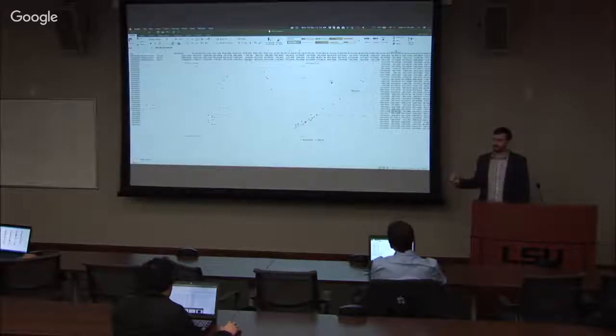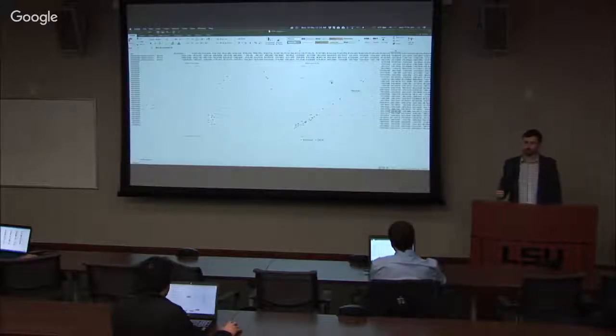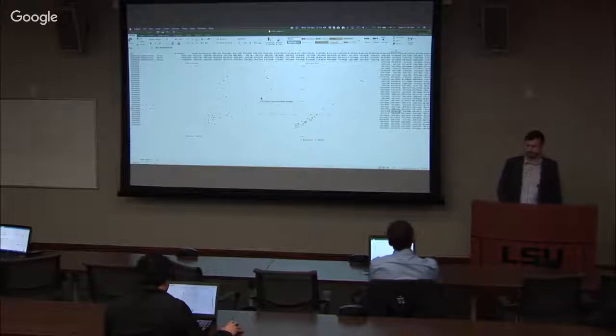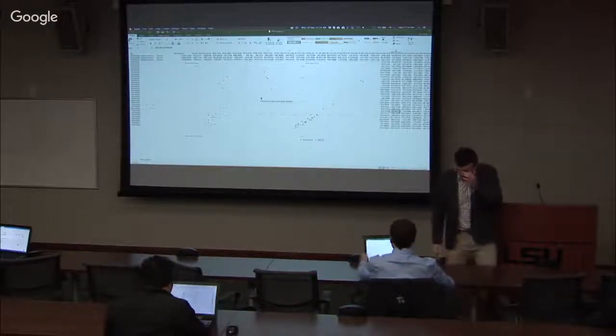So did everybody get to this point? Do you have to merge both files in the same Excel file, or is it a different Excel file? Well, this one is the same. I just copied the chart from the other one. So the PCA result that I got from running that process gives me this.